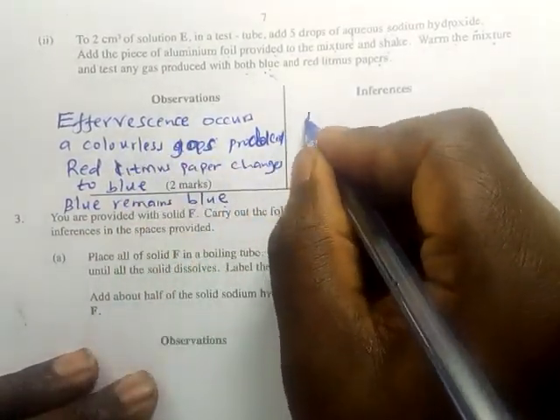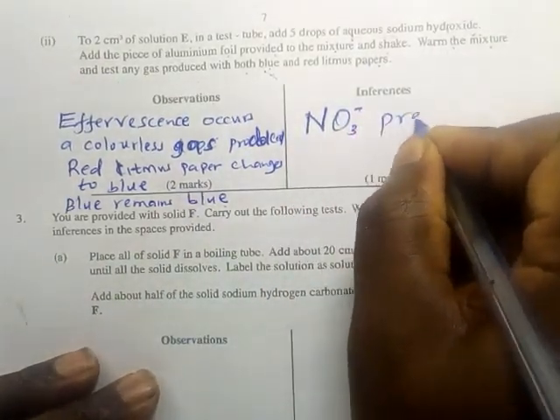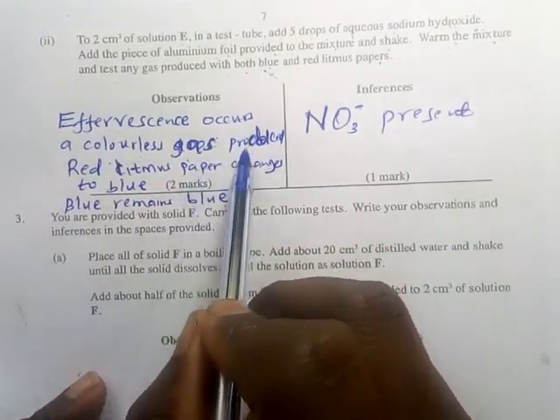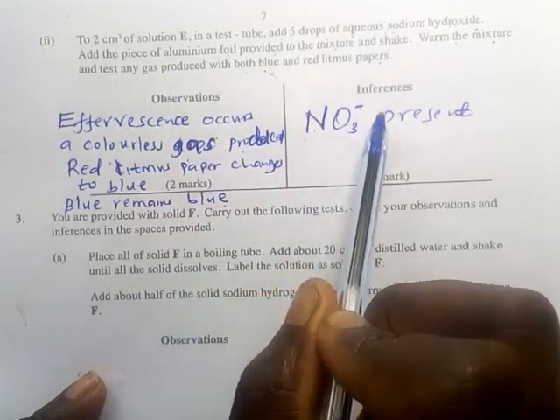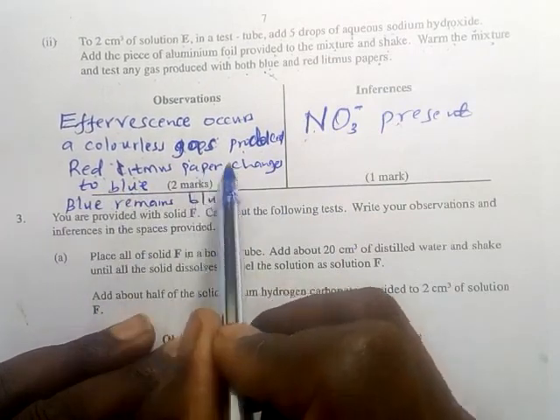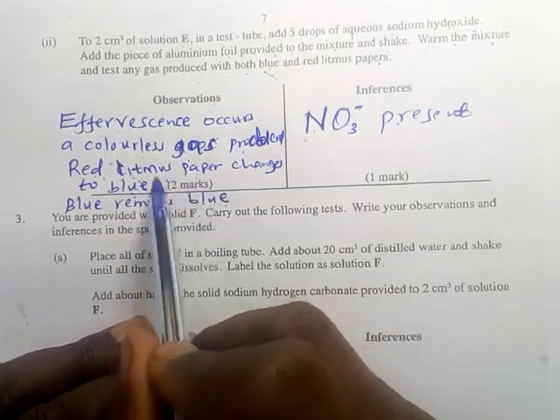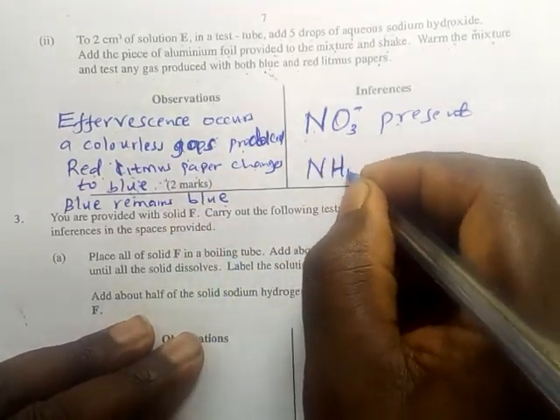So that tells you that nitrate is present. Then inside the mixture the reaction went on, and the nitrate ions were present. Red litmus paper changing to blue means inside there a basic gas was produced, and the only basic gas we know is ammonia gas.